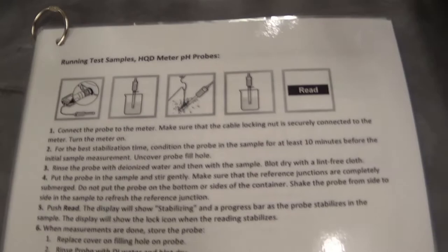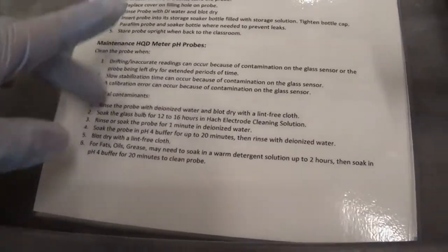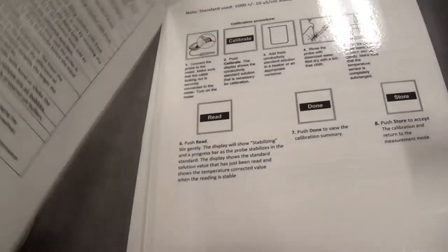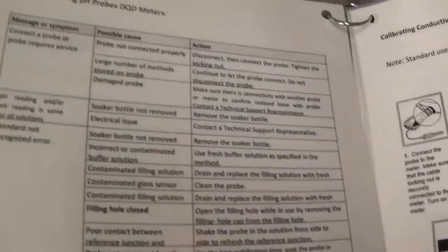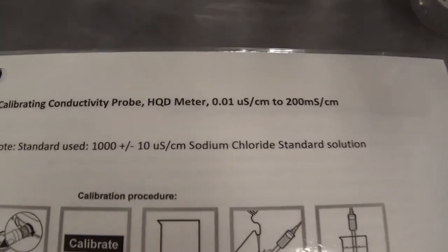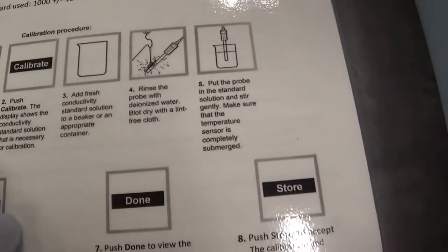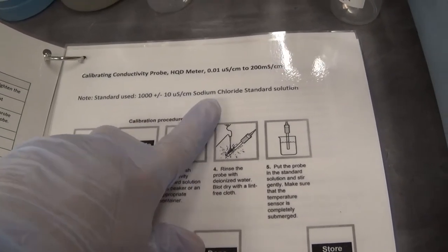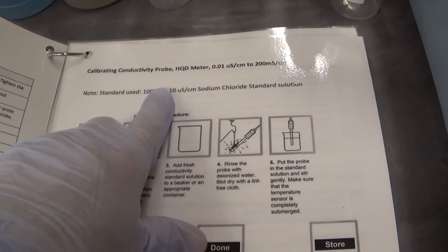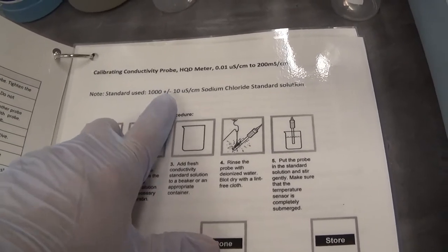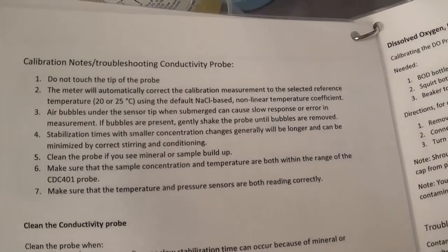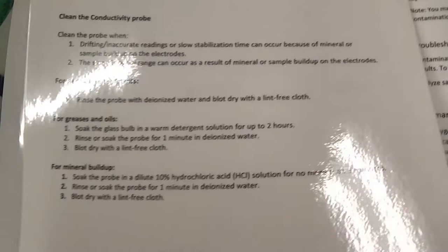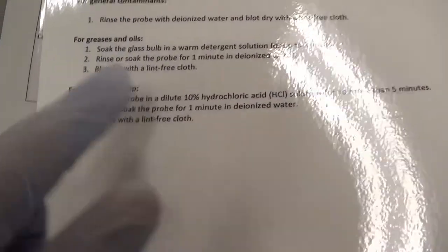Running your test samples for pH and a little bit of maintenance in case there is some trouble, and more troubleshooting problems. Calibrating the conductivity probe with its directions. Our conductivity probe uses 1000 standard and only one standard for these meters. And then notes, troubleshooting, cleaning, that kind of thing.